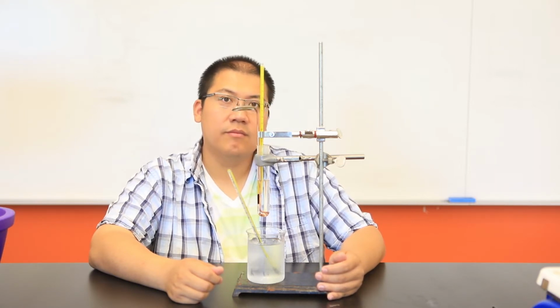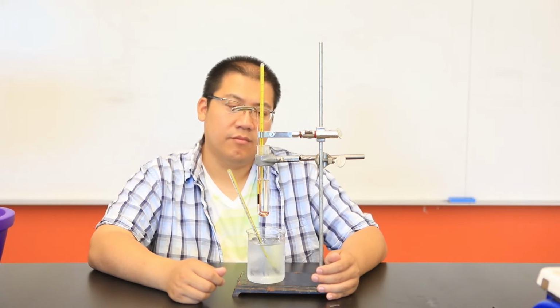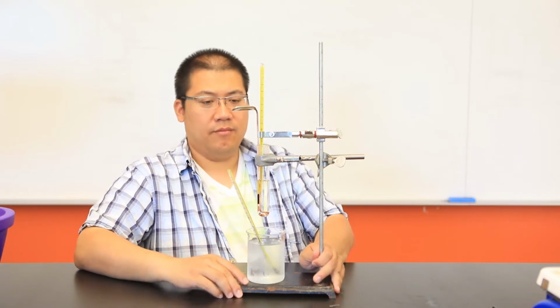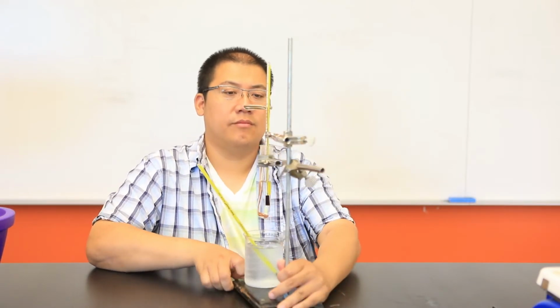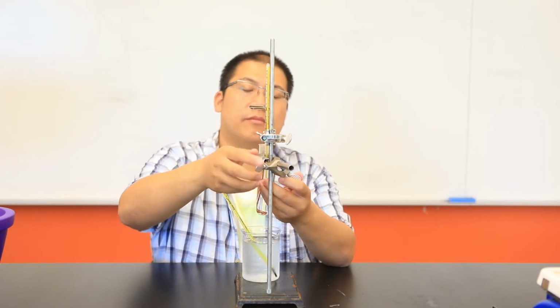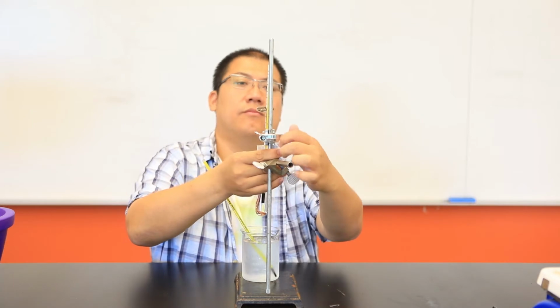Now, do not forget, if you know the molality of the solution, and you know exactly the mass of the solvent that we used, you can also calculate the moles of our solute. From that moles, you can go back using the mass to determine the molar mass. So here our goal is to determine the freezing point of the solution of T-butanol with our unknown compound.